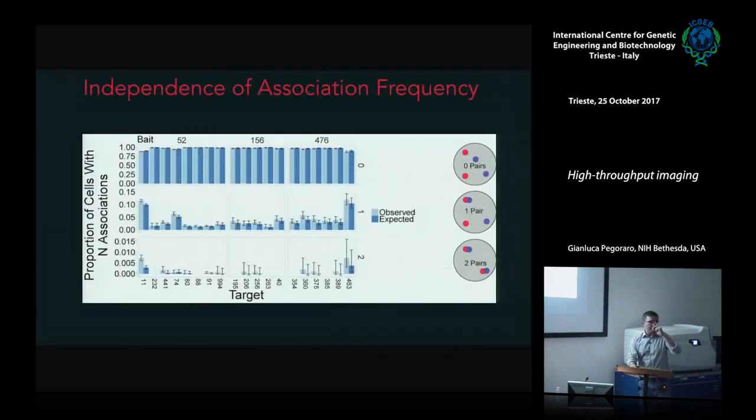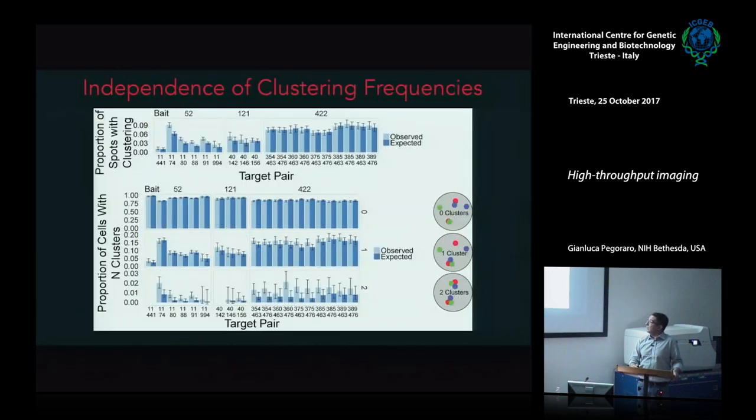To answer the third question, do sister loci actually affect each other? The answer is generally no. Alleles are independent, with one notable exception. And clusters of different genes in different colors appear at an extremely low frequency and also are independent.